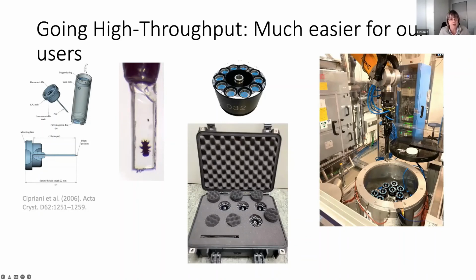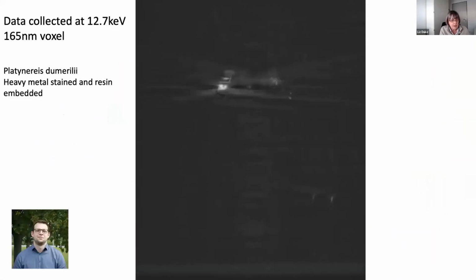And here we have a Platynereis dumerilii sample mounted on the end of a pin. And in fact, this was in the very, very early days of this technique, where we were just mounting everything on a block of resin, as opposed to actually mounting it on the end of the pin, which is what we're now doing. And so just to give you a few examples of what we're doing.